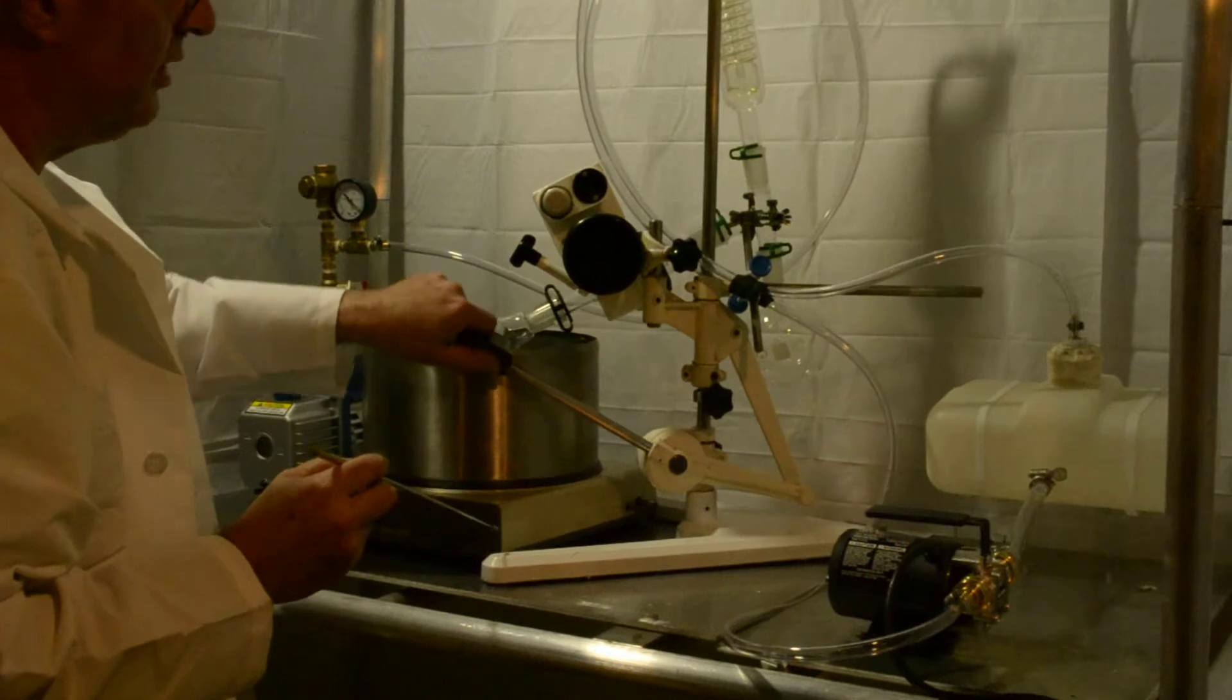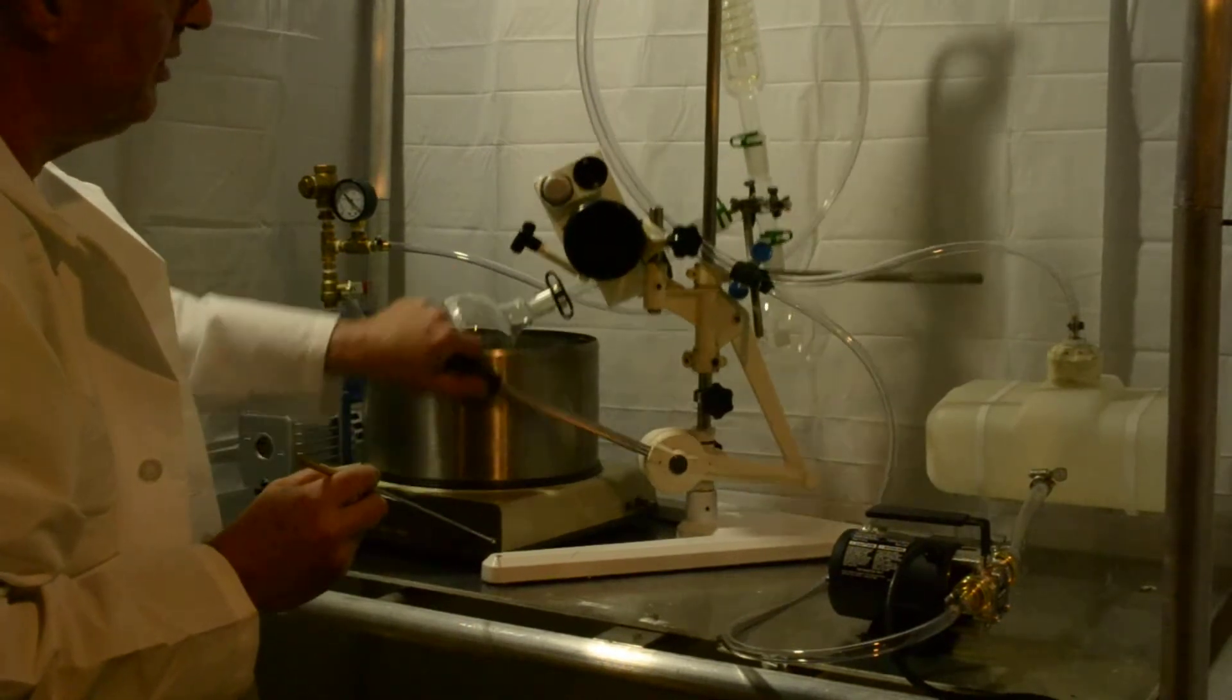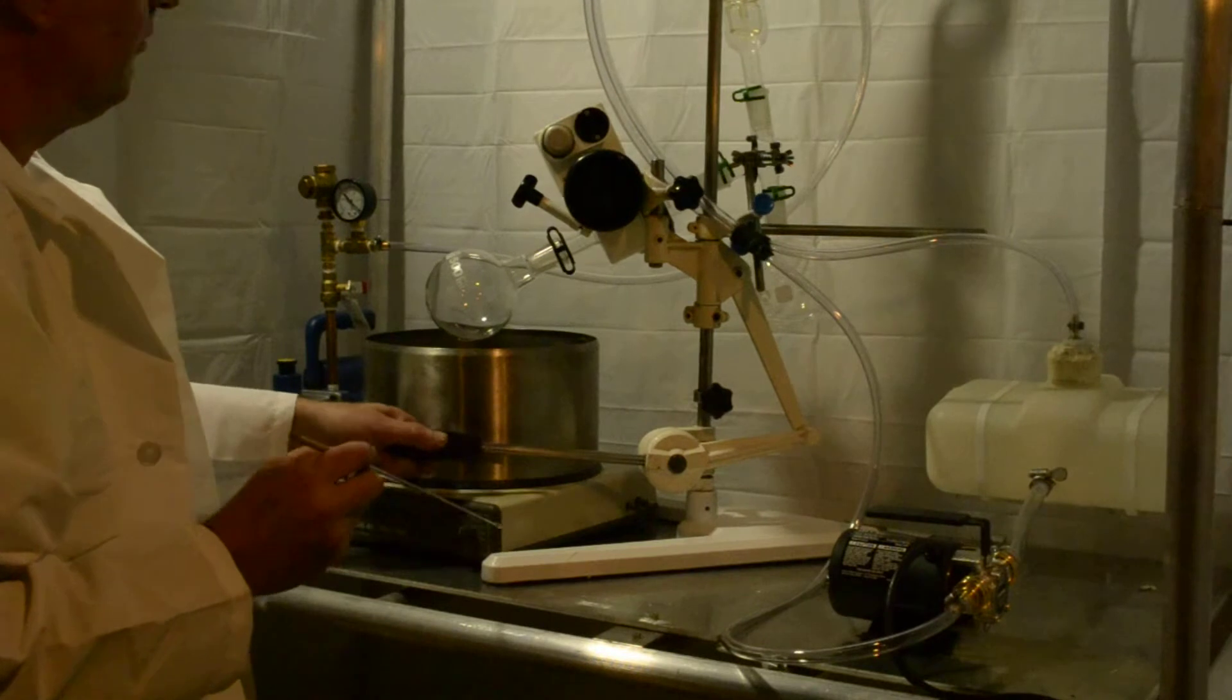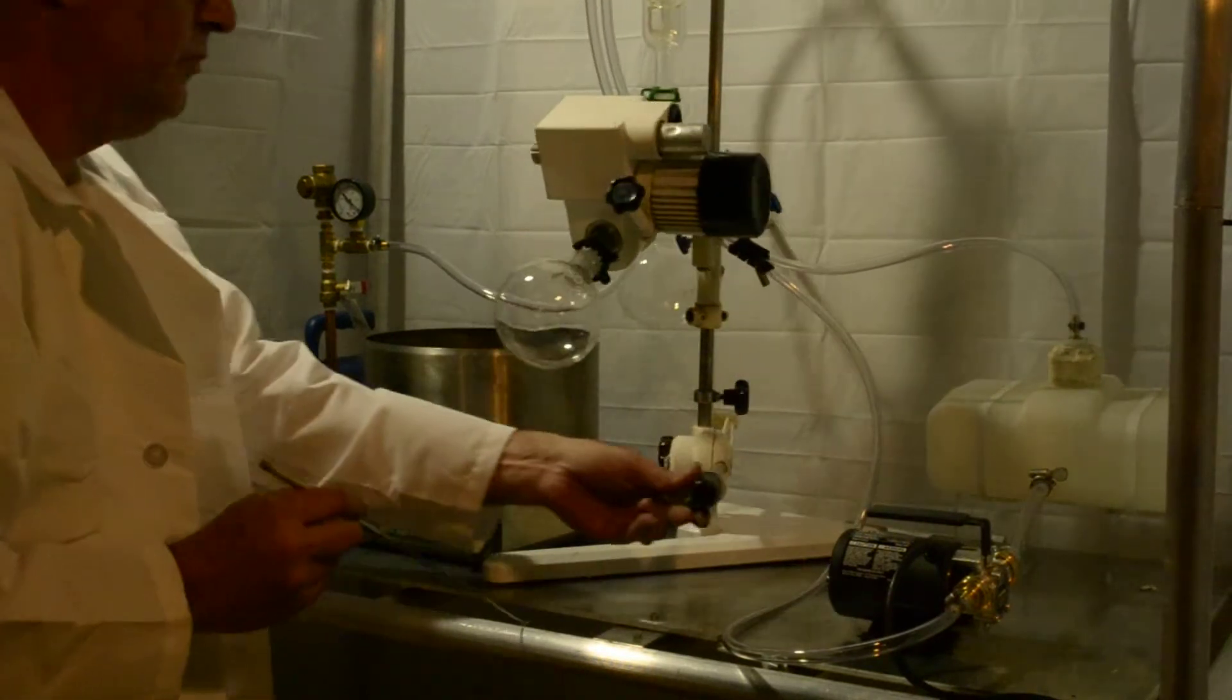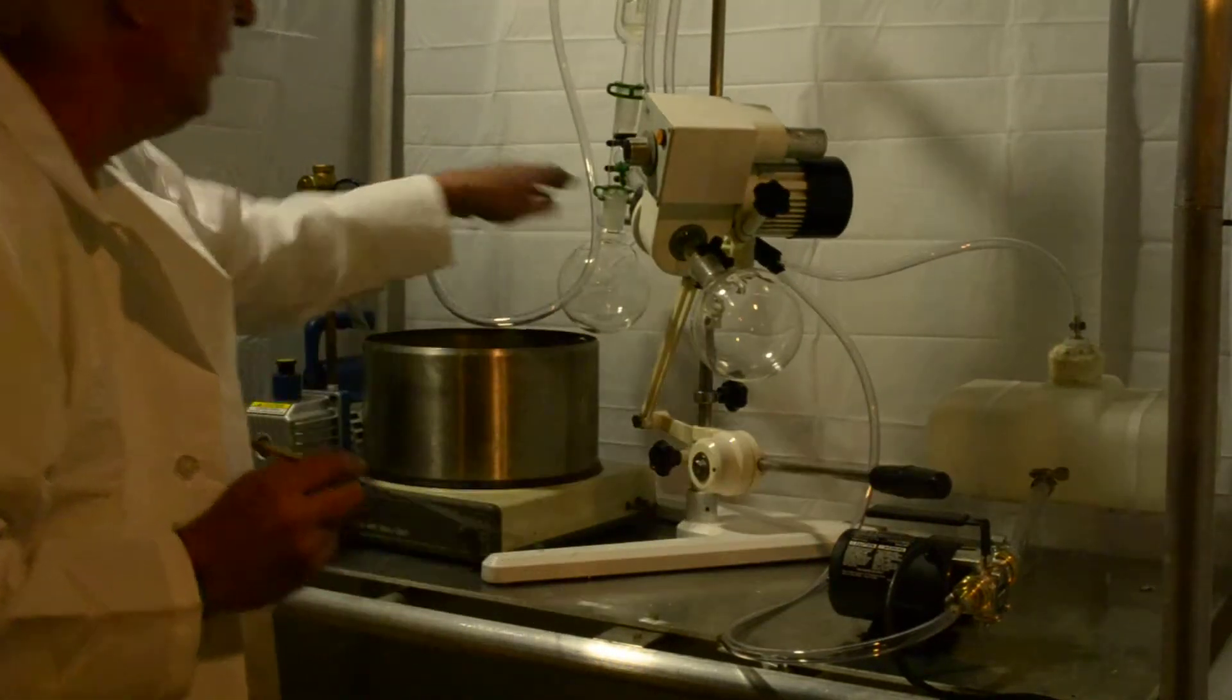So you don't have to touch it, it's just all automatic and there's nothing you have to do.